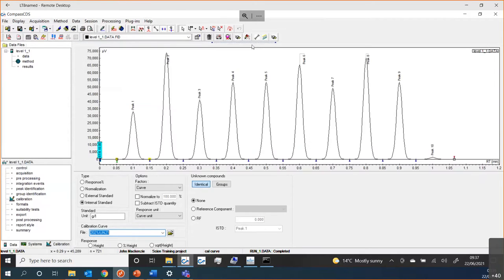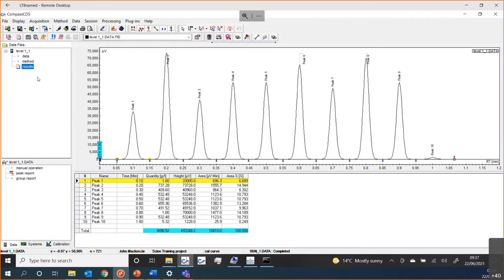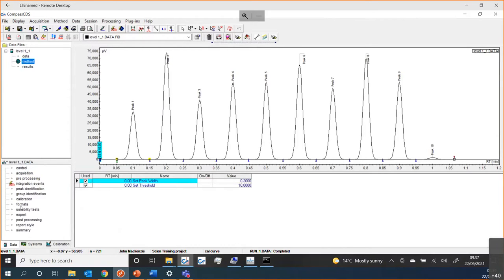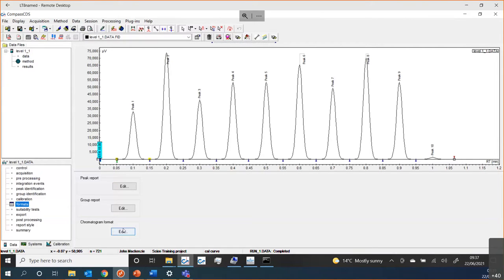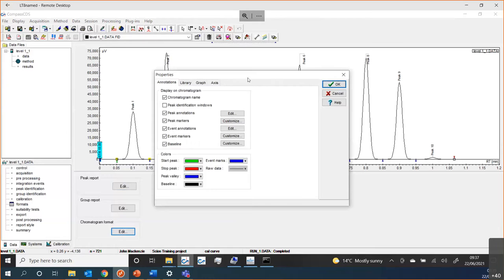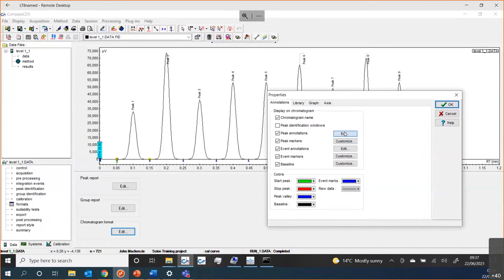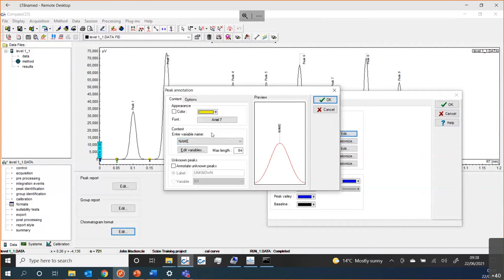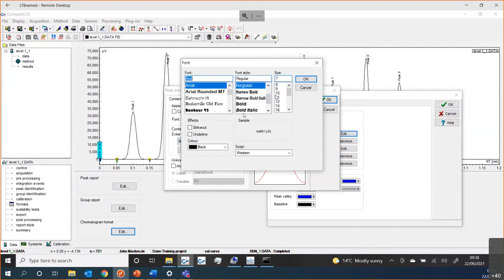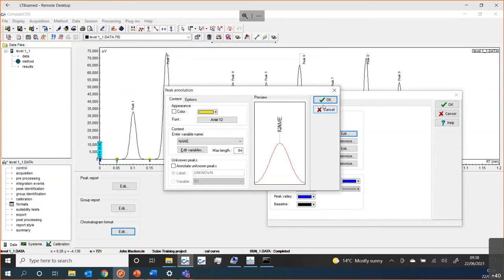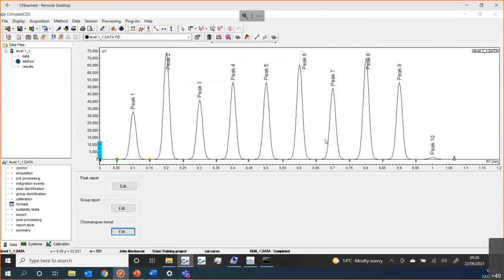Moving on, when we look at our chromatogram, we may want to change what we can see and what it looks like. Maybe we don't like what the peak names look like. There are a couple of ways to do that — we can do it from within the method. We have a section called Formats. You can see what my chromatogram format will look like and what my peak report might look like. Concentrating on the chromatogram format, I can choose Edit and I'm allowed to change quite a few things, such as the peak annotations — maybe a different or bigger font. So if I say OK, you can see they get much larger.